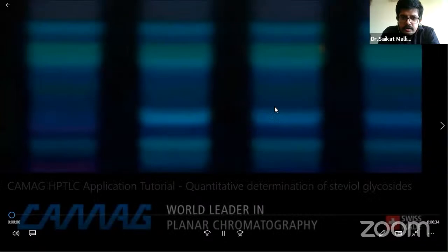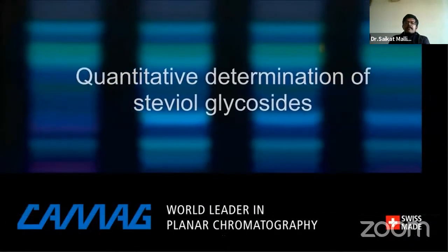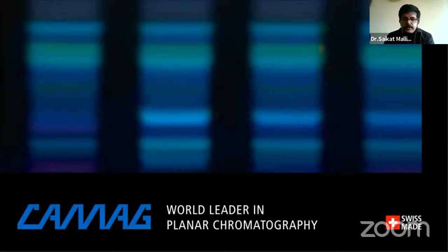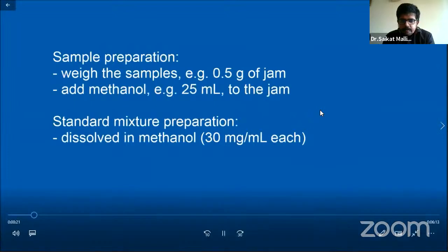So this is about stevial glycosides. We all know about the stevia plant. It's an artificial sweetener. And in this video we will see how stevial glycosides are being analyzed on HPTLC. So these are the aspects associated with HPTLC steps, as I told you. And this is how the entire experiment will be run.